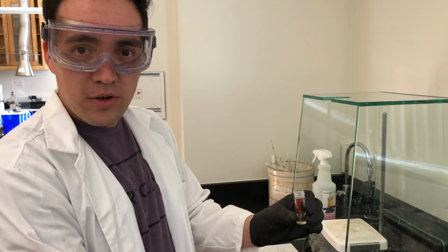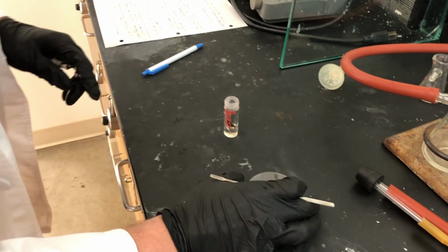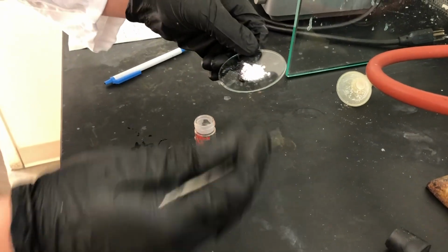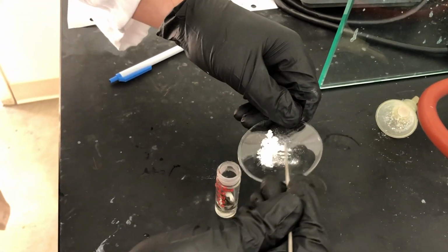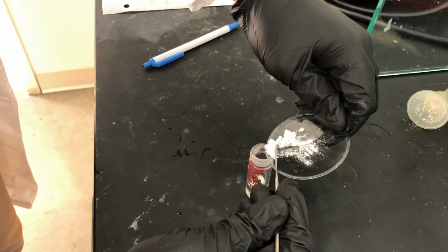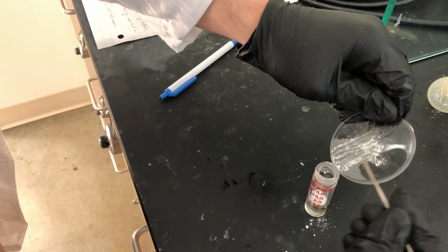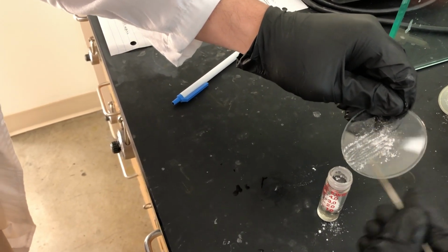We're going to start with a 5 milliliter conical vial. We're going to put a large spin vane in there. We're going to put the 164 milligrams of salicylic acid that we made in step 1 right into the conical vial. I'm going to do it very carefully. I know the instructions say 200 milligrams is needed, but 164 will be just fine.